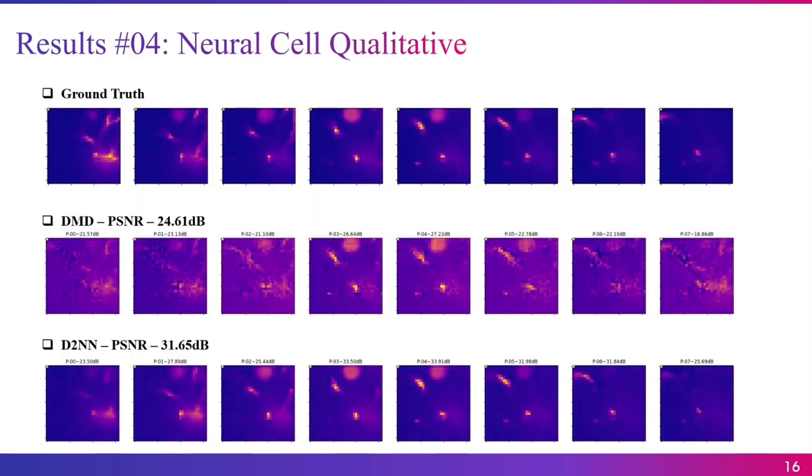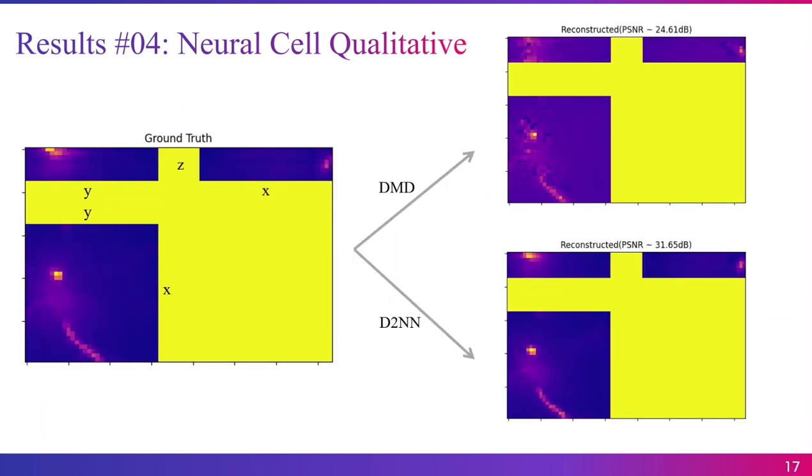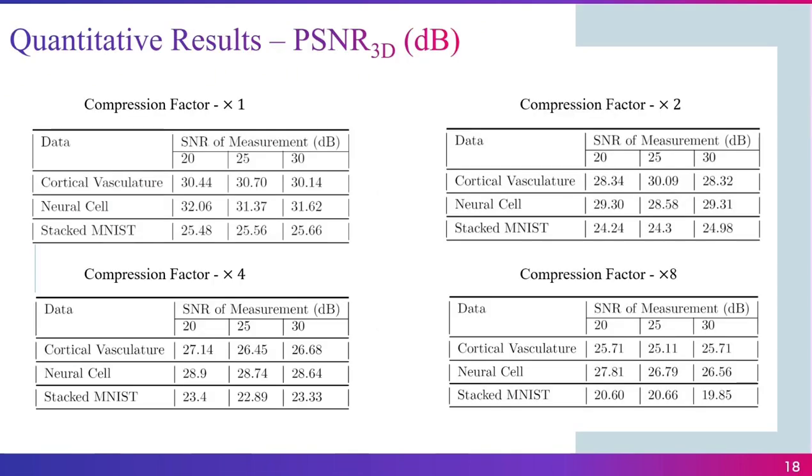These are the quantitative results. In conclusion, our custom microscope design leverages structured illumination and advanced image reconstruction to efficiently enhance 3D imaging.